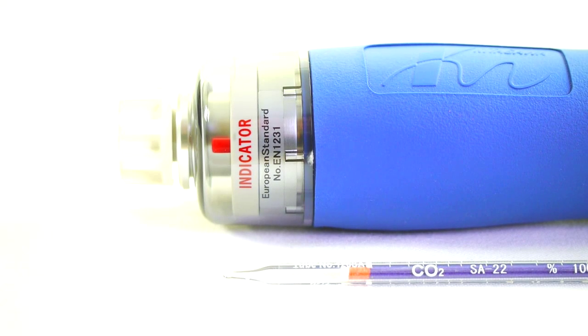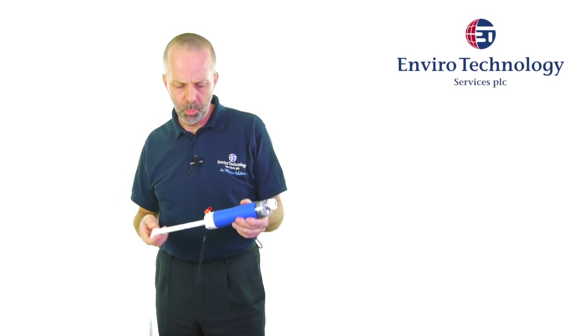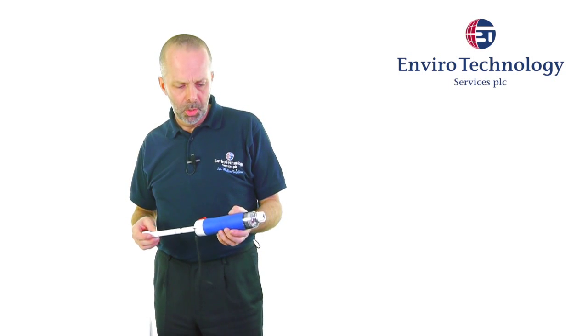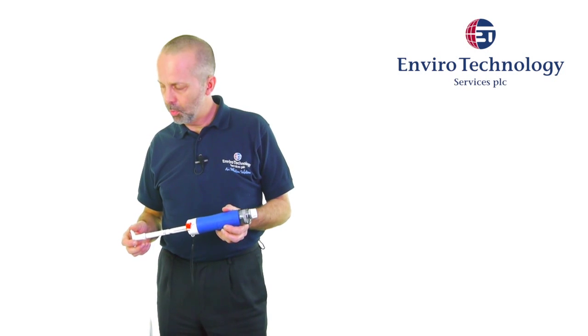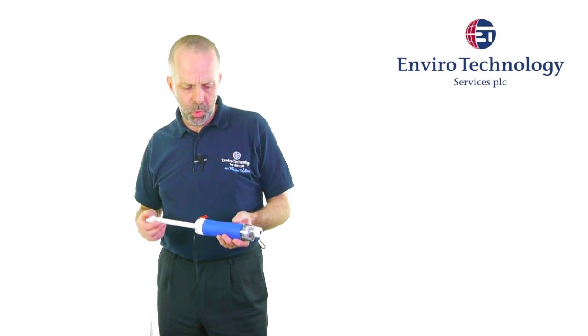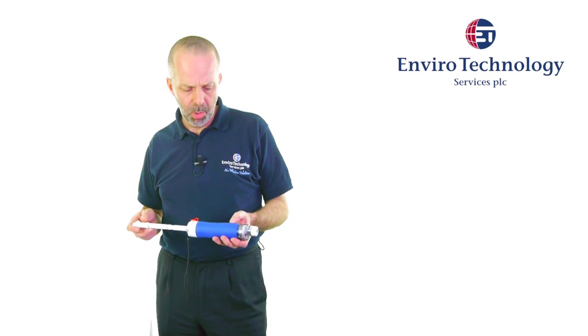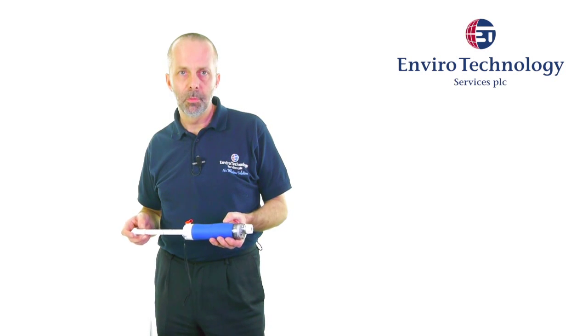The design of the pump means that it will pull through an exact volume of air, 100 millilitres per stroke, so this ensures that the sample volume of air passing through the tube is very accurate. Most of the gases can be sampled with a maximum of three strokes of the pump which means it can be done very quickly, very easily.